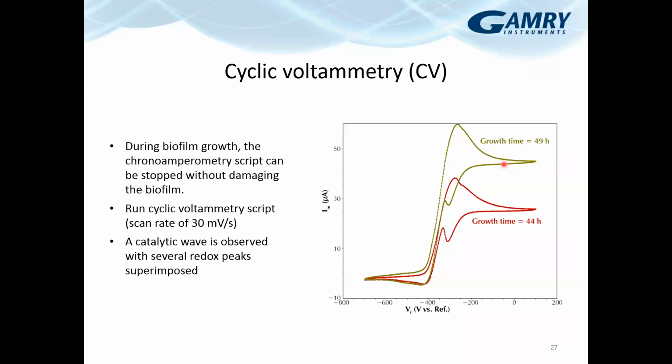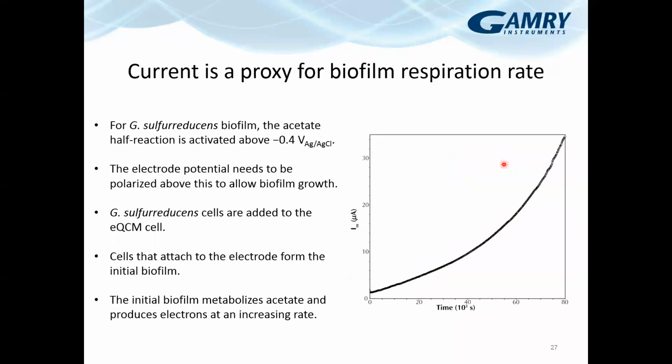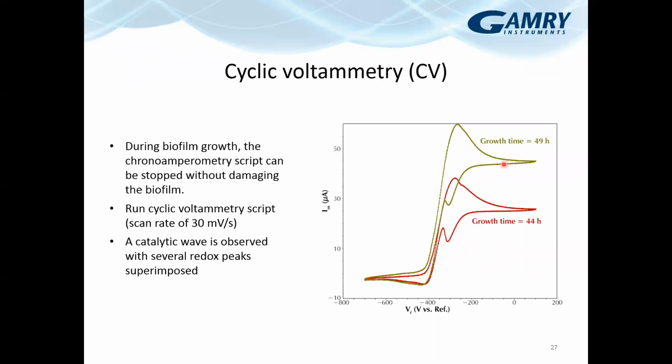But now you can look at, a lot of times people have trouble in this field because you're measuring a current and you think that there's biofilm. You're not sure because really this is an indirect measurement. The current is increasing. It has a semi-log behavior. It looks like an exponential growth curve, and it seems that I'm getting more current and seeing these voltammograms over time. But is there biofilm? I have to do some secondary analysis to get at this question.